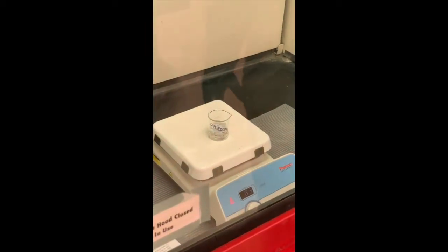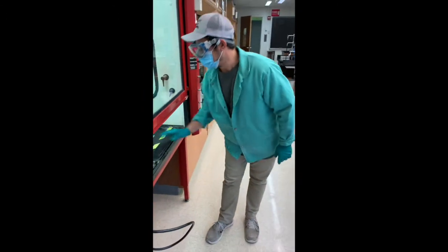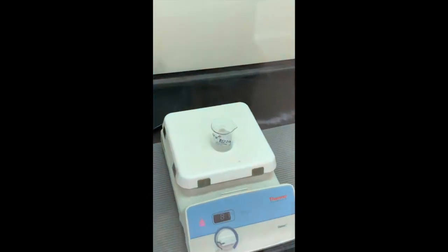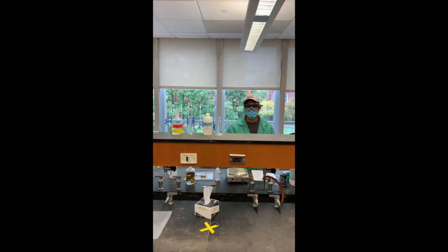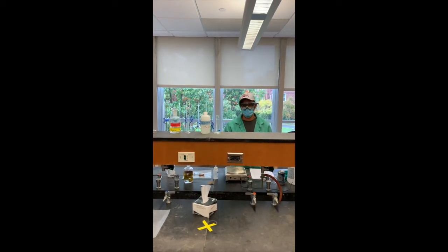This reaction gets very hot, even without the addition of heat from the hot plate, and you'll notice that we start to have the aluminum reacting, and you'll see bubbling. With the added heat from our hot plate, this should take about 15 minutes total. So while our aluminum is reacting in the hood with the potassium hydroxide, we're going to move on to step 4, which is basically doing an observation of reactions with aluminum.